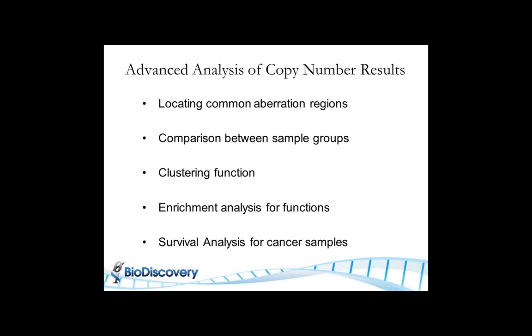Also, based on the sample factors, you can do comparisons between different sample groups. You can also do clustering based on the copy number profile, to see how similar those samples are. You can cluster them based on the similarities.